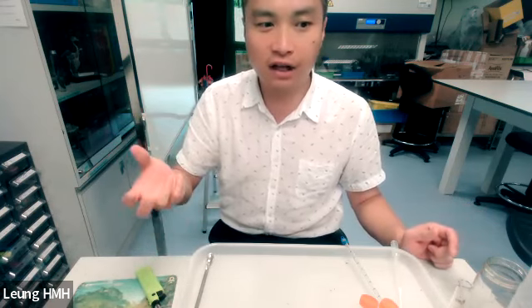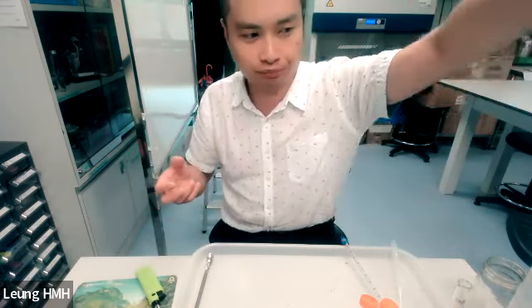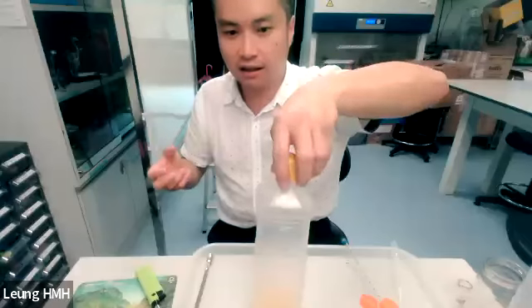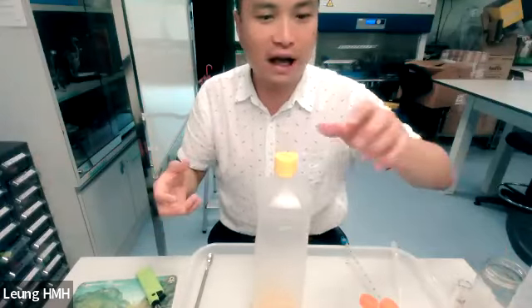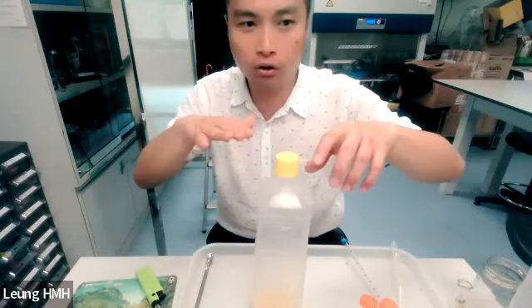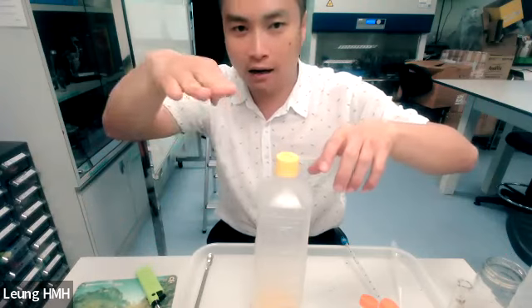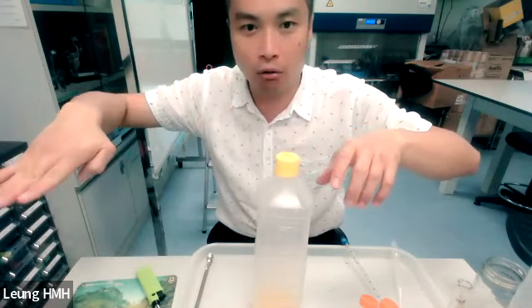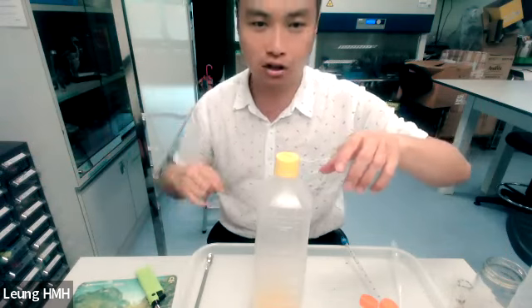And then after 30 minutes, we let the solution stand on the desk for 1 or 2 hours, okay? So that we make sure all the soap content settles at the bottom, and the biodiesel is found at the top of the mixture.